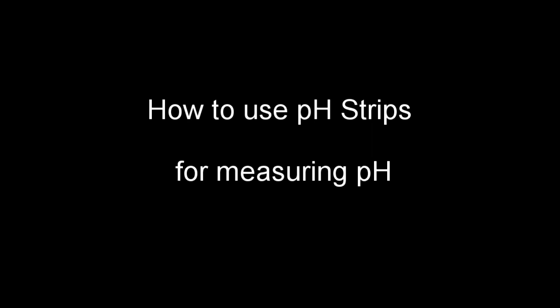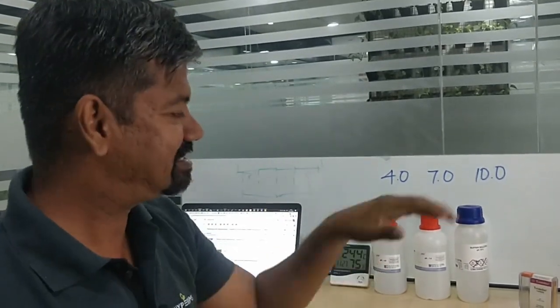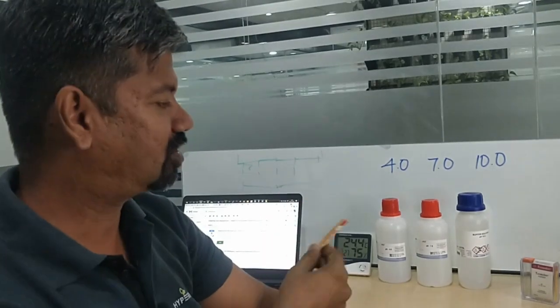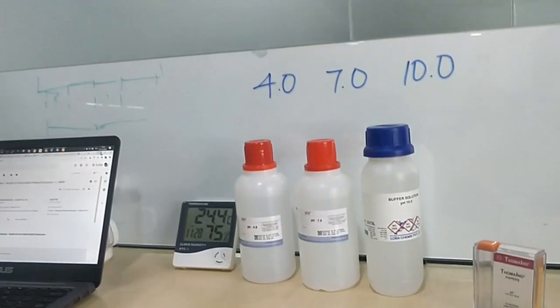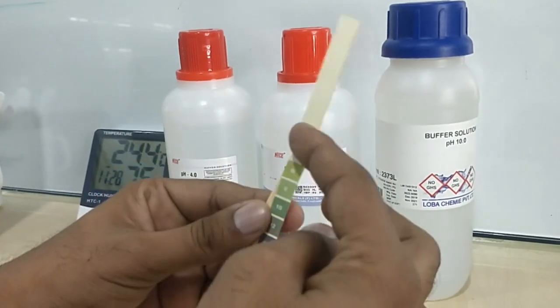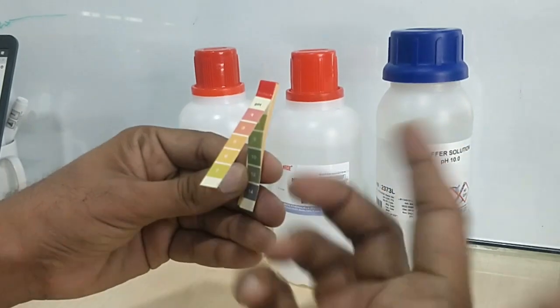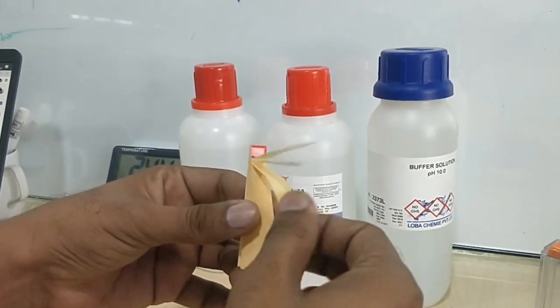Now let's do a small demonstration with the pH strip using our standard buffer solutions — 4, 7, and 10. Let's see how these strips perform and how easy or difficult it is to identify what pH range we are looking at. This is a strip with color codes 1 to 7 on one side; flipping it over gives 8 to 14. Shades of green for the lower range and shades of pink to orange for the higher range. These are strips we take individually to dip in each solution.